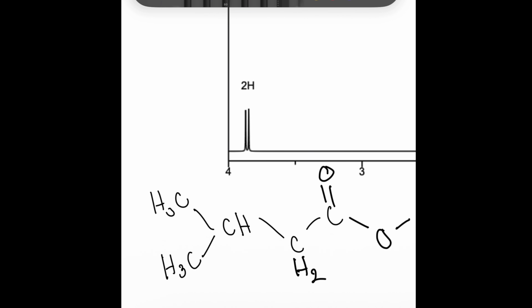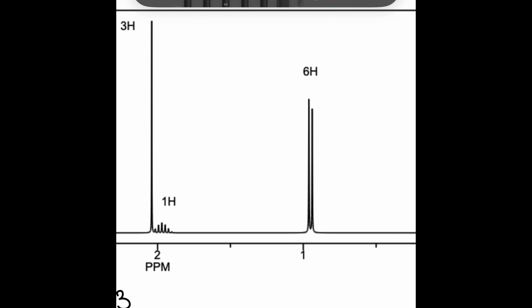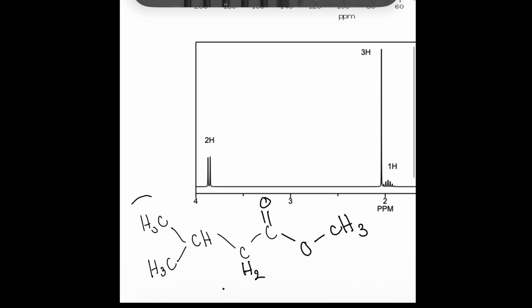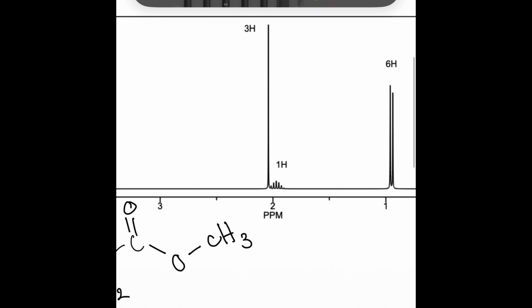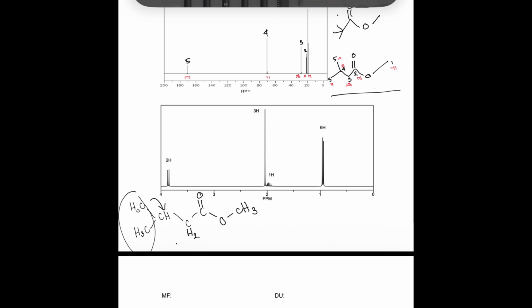Because there are 6 hydrogen atoms here, this would only approximate to 1 peak, but because of its neighboring CH right here, it'll be shown as 2 peaks. Again, that is because of that neighboring hydrogen. Those would be the 2 peaks, and they're both observed below 1 for that value. So that checks out as far as the ppm value goes.